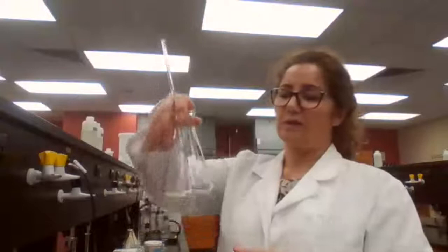Activated charcoal removes colored impurities. With the colored impurity being removed, the solution is going to be colorless, or not colorless, but its original color. So if your impurities are colored, then you can use the activated charcoal.